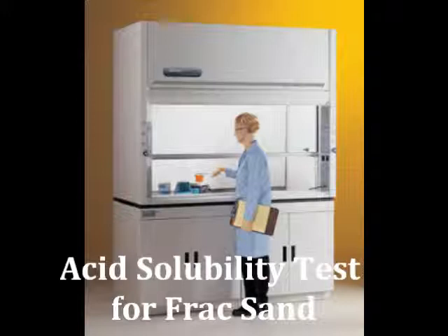Okay, this needs to be done on unaltered whole grain sand. You don't want to use anything that's been crushed for the crush test. And it uses hydrochloric and hydrofluoric acid. Nasty stuff, hydrofluoric acid is. Can kill you pretty quickly, actually. It's pretty nasty. So you want someone experienced to do this and under a good hood so that the gases evolved, fluorine gas possibly, isn't inhaled.